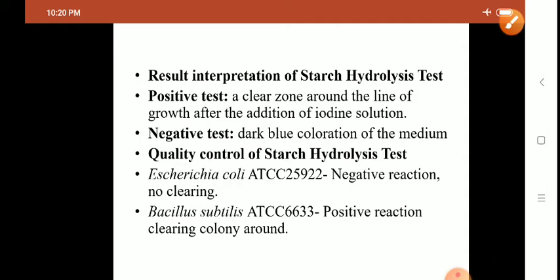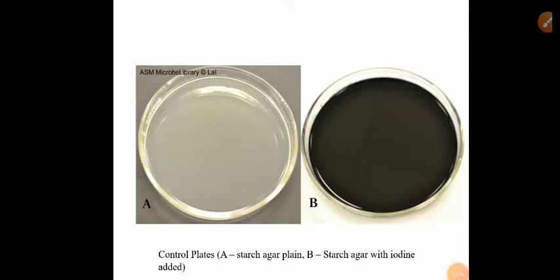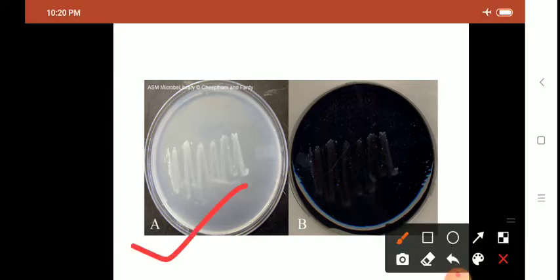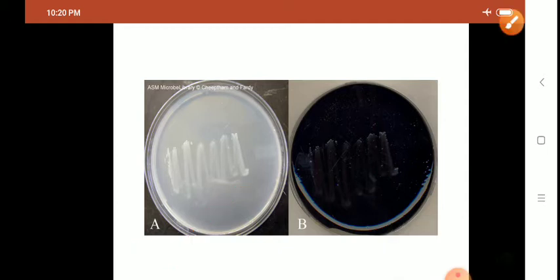E. coli is amylase non-producing — negative. Bacillus subtilis gives a positive reaction. You can see a clear zone surrounding the colony. These are control plates: the first is starch agar, and in plate B — starch agar where you have added iodine — you can see a blue color. This picture shows a negative result: organism inoculated in plate A, iodine poured in plate B, no clear zone surrounding the growth of the organism, so organism is amylase negative — amylase non-producing.